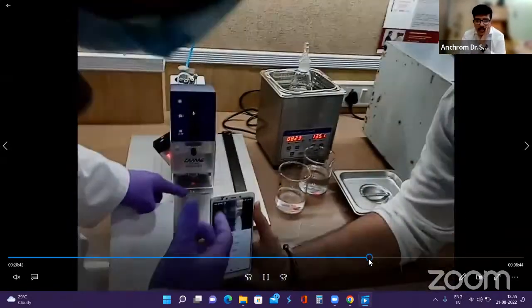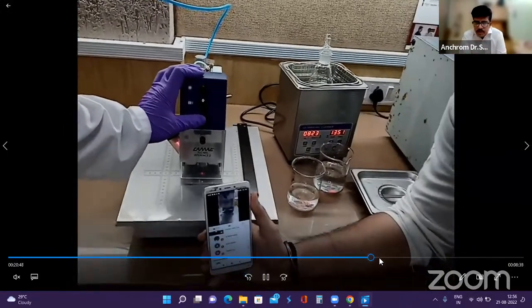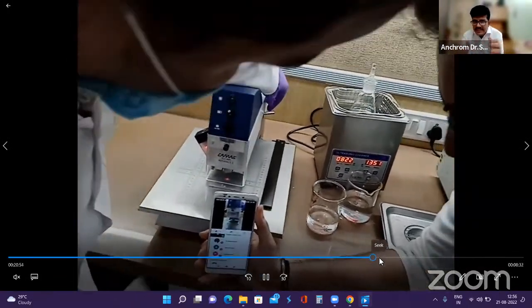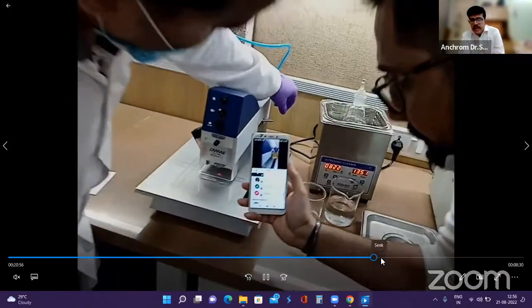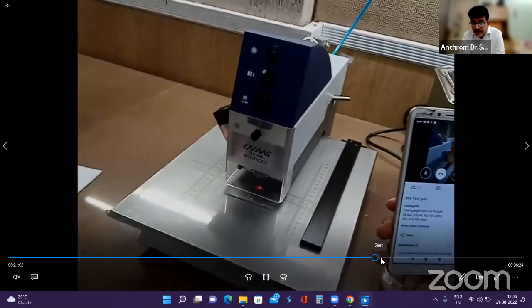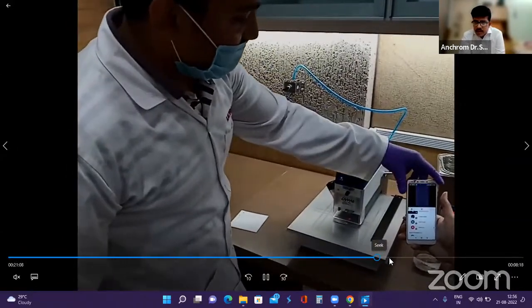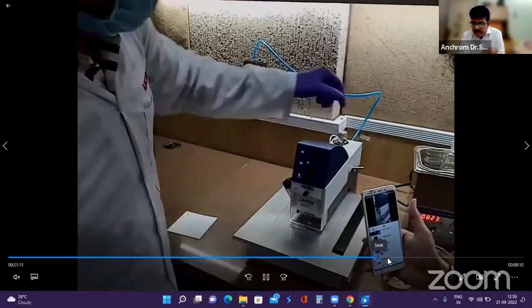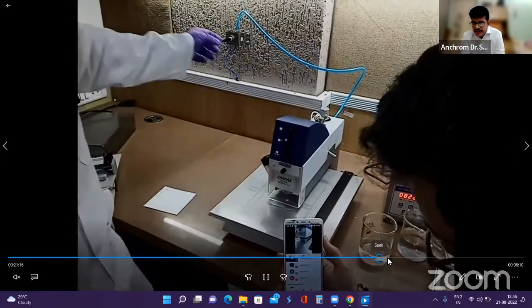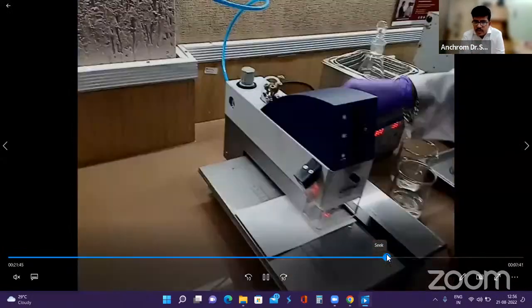So here you have a laser pointer through which we accurately place the plate, and the spot which we want to elute is accurately marked. These spots are first marked under UV with the help of a pencil, and after that, with the help of this pointer, we exactly locate the spot which has to be transferred. Then on the right hand side, that steel lever is the extraction lever. By default, it is in bypass mode. It does not elute the sample. When you pull it in front, the elution head gets activated and the solvent is passed from the head and collects the analyte and sends it to the mass spectrometer.